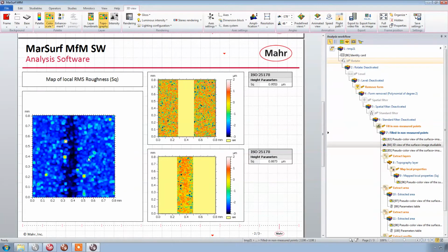So we can visualize that very nicely. Aha, around the pencil lead, we do see a decrease in the roughness. We can also capture that in even more detail if we want to. So what I did here is I removed the penciled in area, the pencil line. I cut that out and I calculated the RMS areal roughness for that area, so SQ for that area.